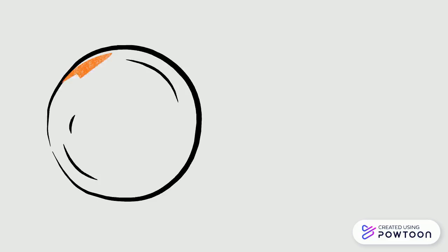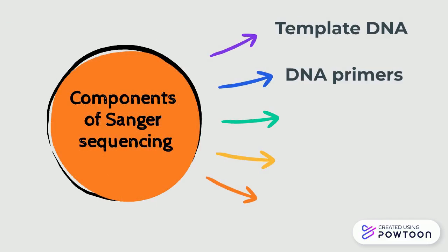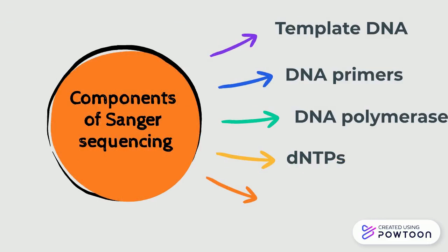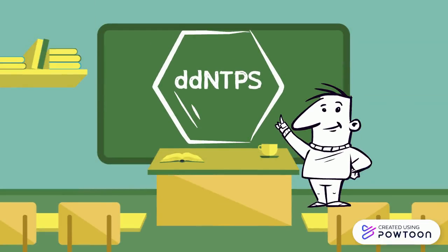The basic components required are amplified DNA template, DNA primers, DNA polymerase, deoxynucleoside triphosphates called dNTPs, and modified dNTP called dideoxynucleoside triphosphate, ddNTPs. ddNTPs do not have the 3' hydroxyl group that allows phosphodiester bonds to form with the 5' phosphate on another nucleotide to form a chain. This results in termination of the elongation of the DNA template at the site of ddNTP insertion.